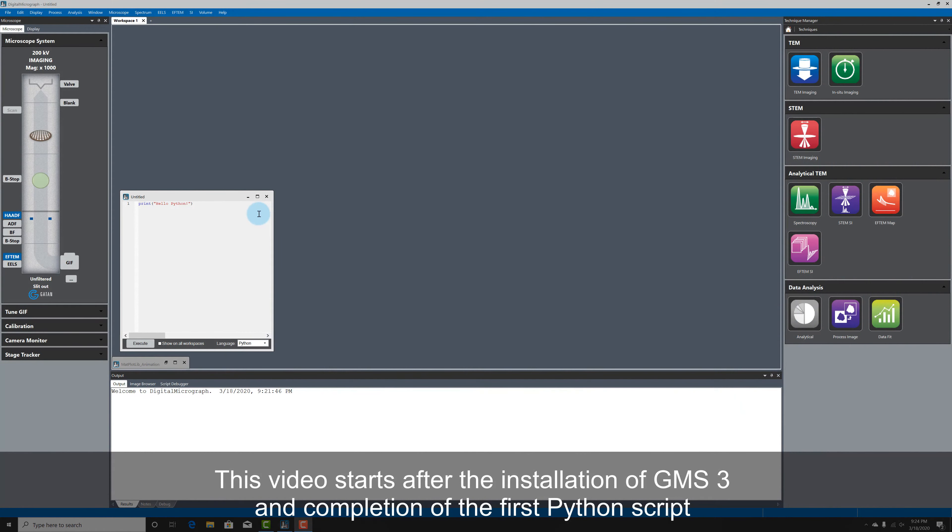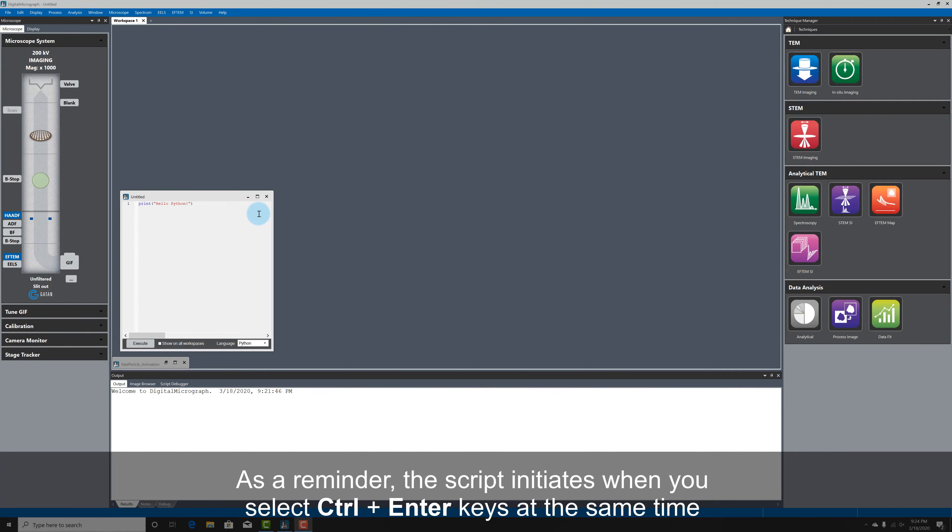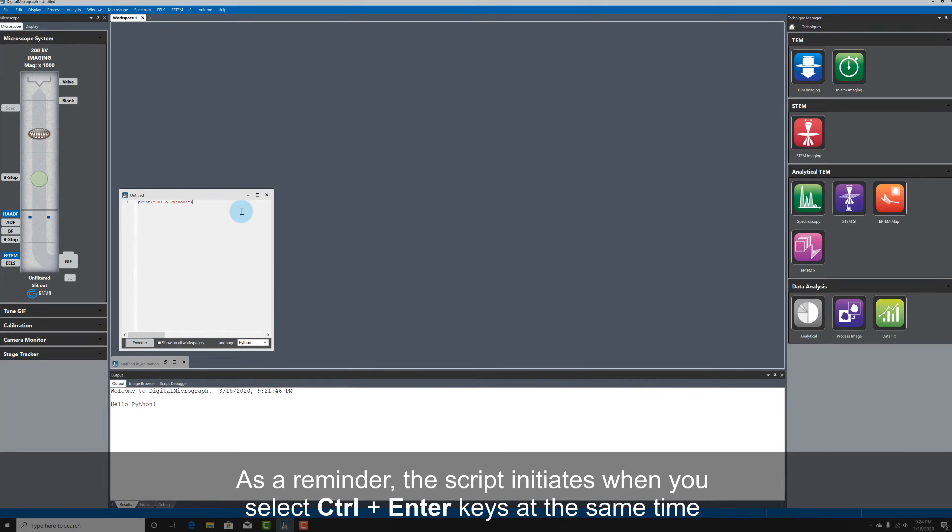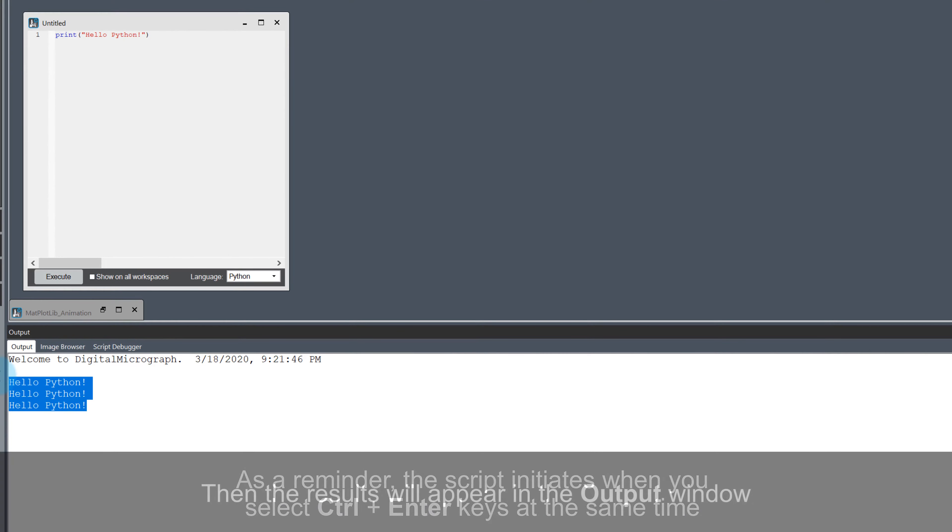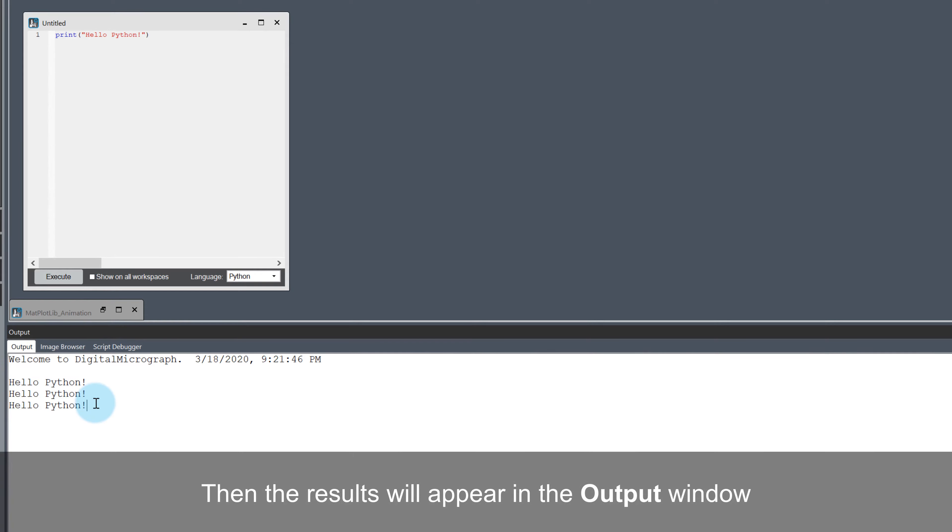I'm starting off from where we left before in video 1, with our first Hello Python script still open. If I hit Ctrl and Enter keys at the same time, the script is executed, as we saw before, and the output of the simple print statement is shown in the results window of GMS.